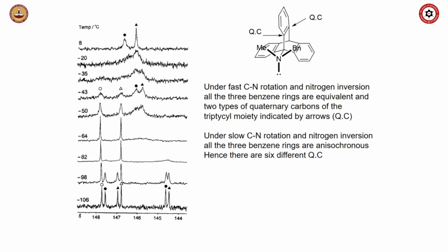And here you will see the backside carbons are also distinctly different from each other. So the backside carbon comes as a 3 carbon signal, and the front side quaternary carbon comes as a 3 carbon signal. Totally 6 peaks are seen here.